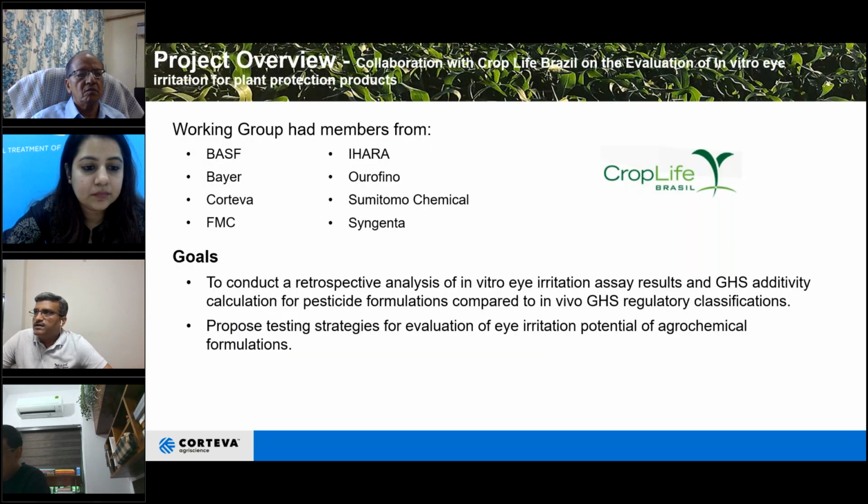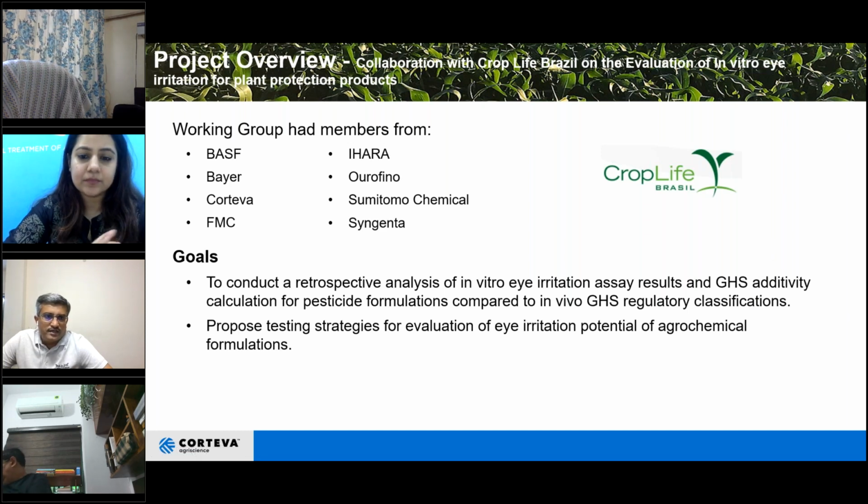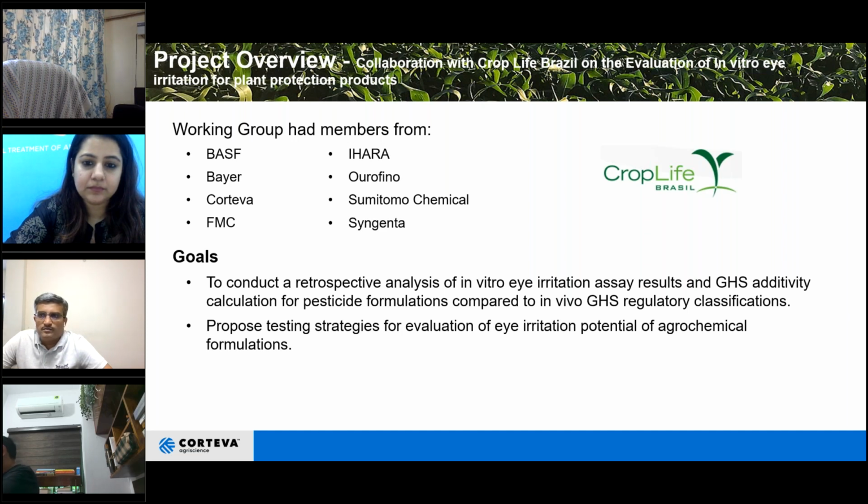Recently, industry made an effort in collaboration with CropLife Brazil, wherein a retrospective analysis of the eye irritation in vivo and in vitro test data was conducted. For this project, working group members included agrochemical companies, and the goal was to conduct a retrospective analysis of in vitro eye irritation assay results and GHS additivity calculation for pesticide formulations compared to in vivo GHS regulatory classifications, and to propose testing strategies for evaluation of eye irritation potential.